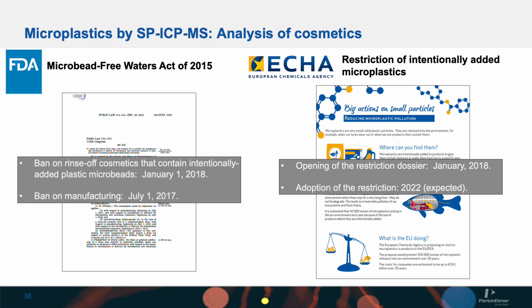Our first application consists in the detection of microplastics in cosmetics. Microplastics are intentionally added to cosmetics and personal care products mainly as abrasive agents for skin exfoliation and teeth cleaning, ending up in domestic sewers once they have been used, and after that in urban sewage networks, wastewater treatment plants, and eventually in rivers and sea.